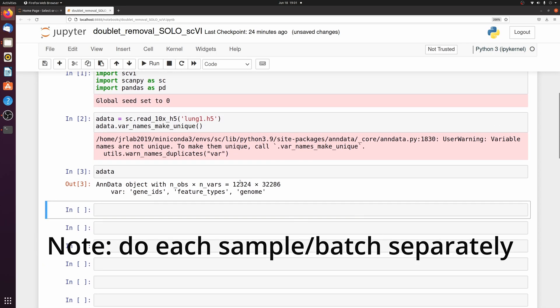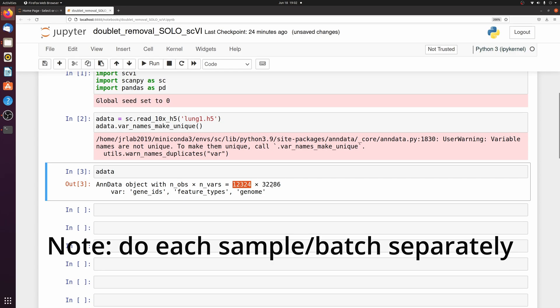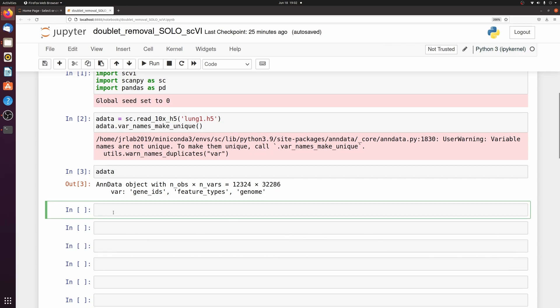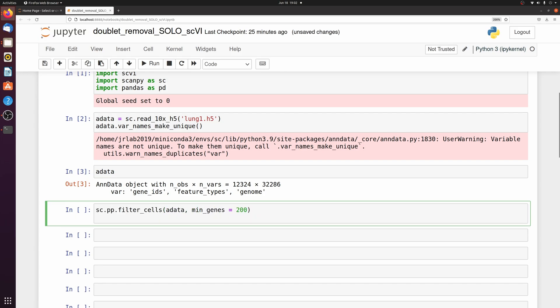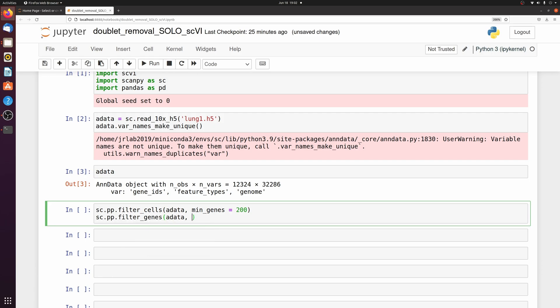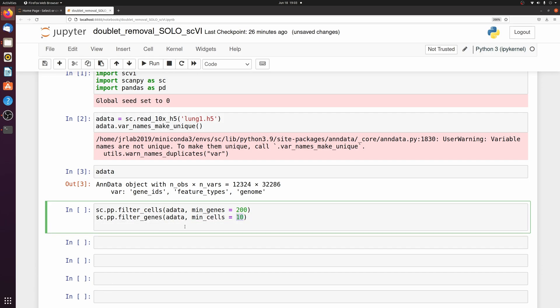So I have 12,000 cells and 32,000 unfiltered features. We're just going to do a really simple pre-processing and then we're also going to subset adata based on the highly variable genes.